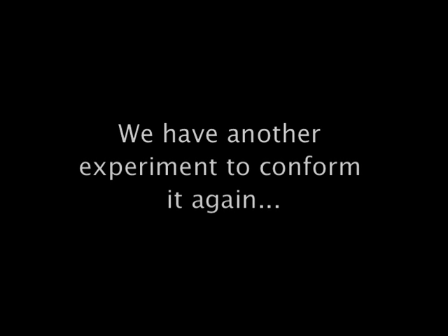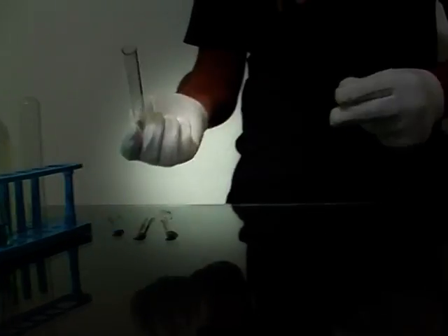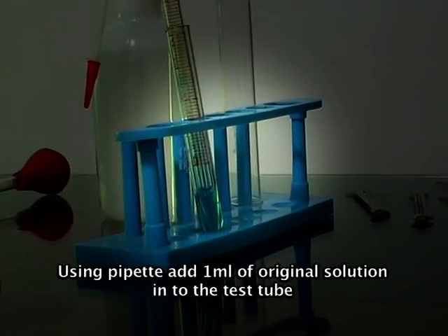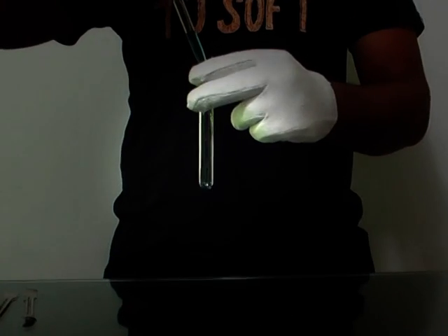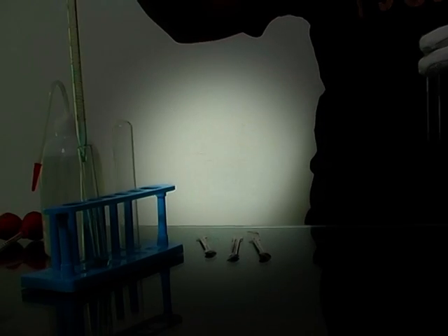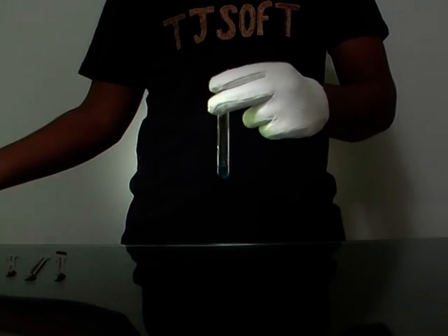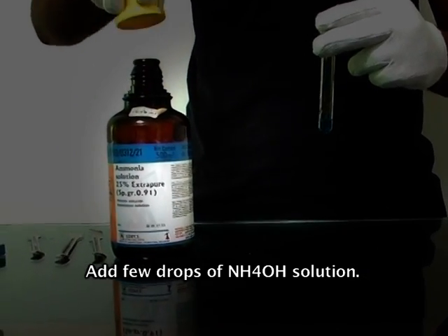We have another experiment to confirm it again. Now take another test tube. Using a pipette, add one ml of original solution into the test tube, and add a few drops of NH₄OH solution.